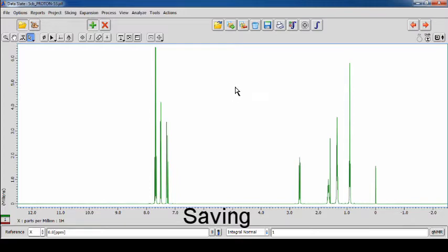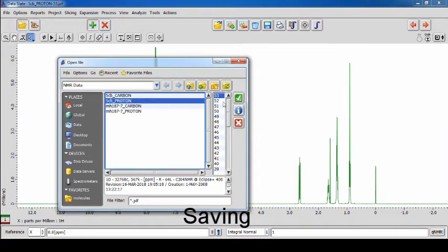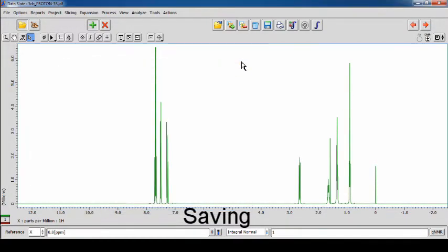Please note though, saving does not overwrite the data file, but will create a new version which can be seen in the File Explorer as it lists the data file versions. The Print All Geometries tool will allow you to print every geometry instance in its current form with all layers to a physical copy.